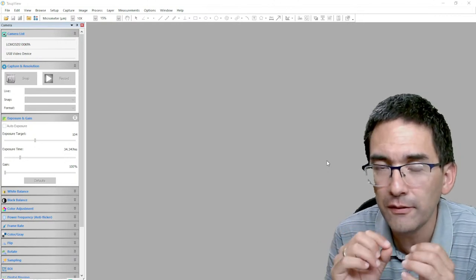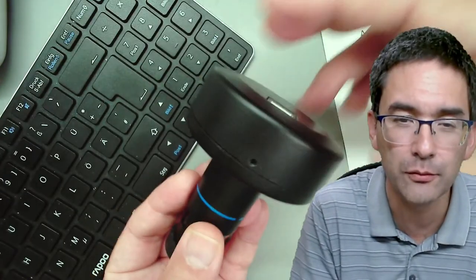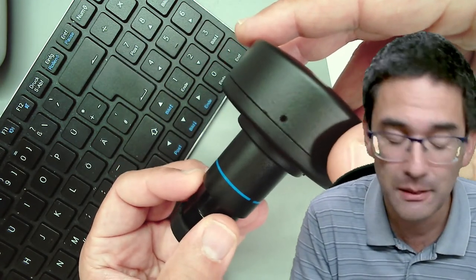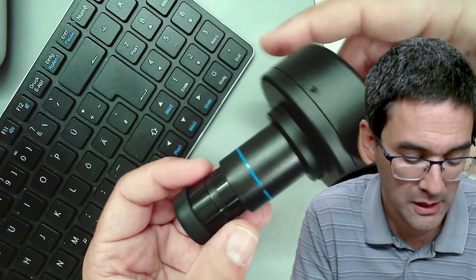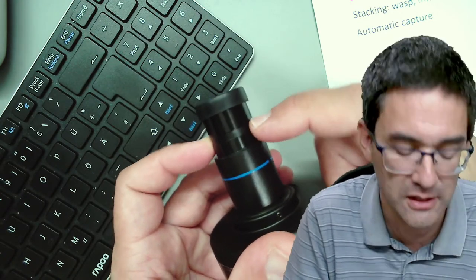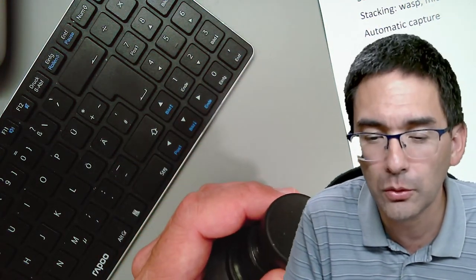So essentially, if you have a mechanical stage, an XY stage, then this is, of course, not a problem. And sometimes the cameras, I'll show you over here again on the desk, okay? If you have the camera over here, when it is in the microscope, then of course, it can also be rotated. So what I have done in the past is I put some sticky tape around it, so that I was not able to accidentally bump into the cable going down and rotate it. Some of those cameras also have a rubber band over here so that it doesn't rotate so easily. That's why there is this little thing here, so that you can put a rubber band here and it's a little bit more snug and doesn't accidentally rotate. But rotation is pretty important. So I will go back again over here.